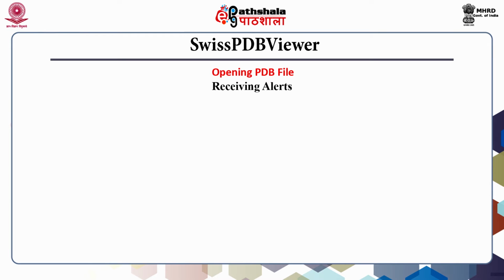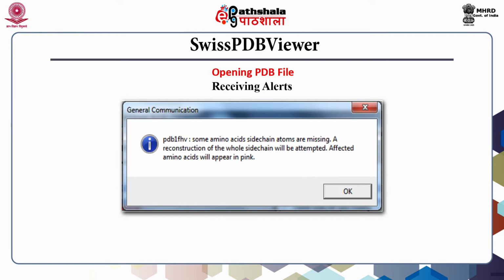Since the checkbox for receiving alert when some side chain atoms are missing upon loading a structure was also left checked, the general communication that some side chain atoms are missing is received. You can also uncheck the checkbox in case you are not interested in reconstruction of 3D coordinates for these missing atoms. However, when the missing atoms in this side chain are constructed, these are shown in pink color in the control panel, which will be introduced in a short while.